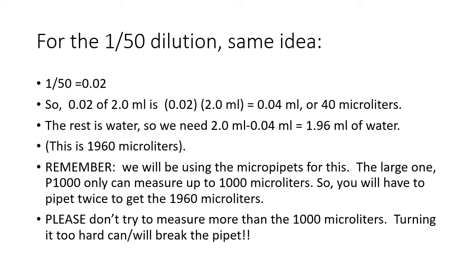Right, same idea for the 1 to 50th. 1/50th is 0.02. So 0.02 of 2 mils is 40 microliters. So the rest is going to be water, and that's 1.96 mil, or 1,960 microliters.